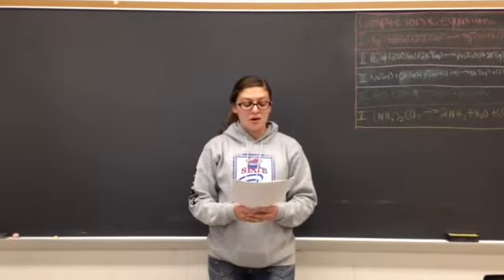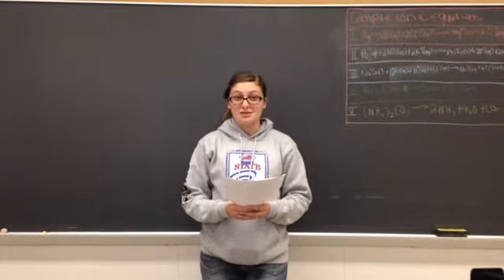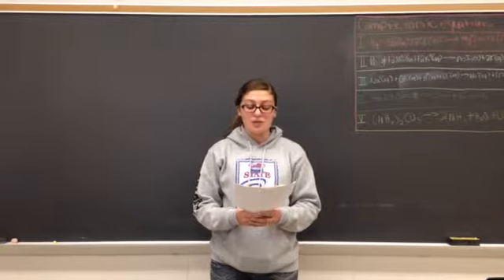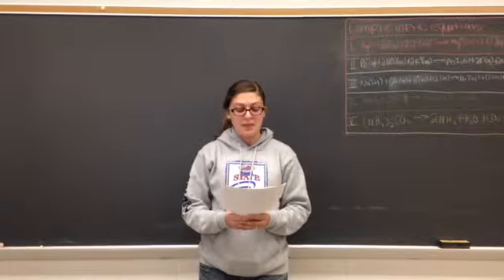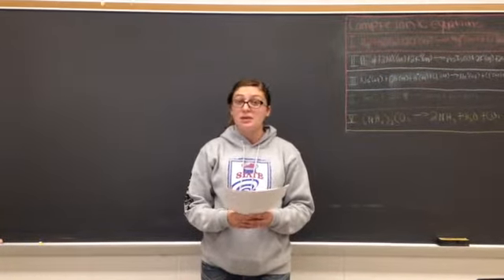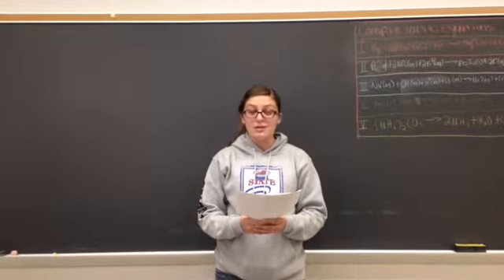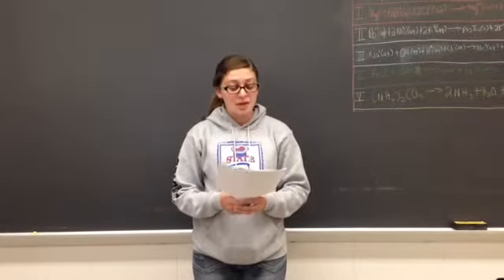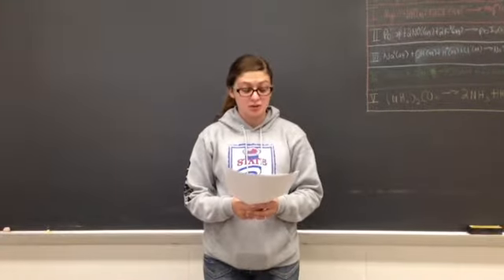For our second part, we will be reacting Pb(NO3)2 solution with KI solution. Transfer 10 drops of 0.1 molarity Pb(NO3)2 into a test tube. This will be a clear and colorless solution. Next, transfer 2 drops of 0.1 molarity KI into the Pb(NO3)2 test tube. This reaction will result in a cloudy neon yellow solution. Discard the test tube contents into a specified container. For procedure 3, we will be reacting HCl solution with NaOH solution.